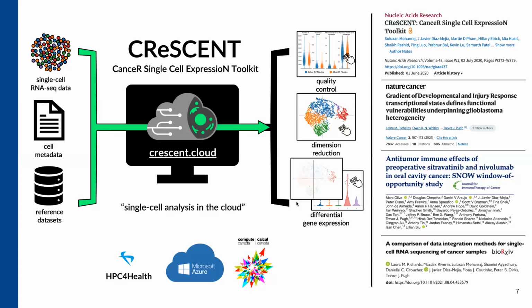And so what we did with Crescent was we analyzed the patient's blood and immune system and all kinds of different cells in order to see whether the immunotherapy actually changed the results. So in essence, we should be seeing a larger infiltration of immune cells based on this immunotherapy. And the main work from Crescent was the postdoc at our lab previously, Javier, and Hugh was the one that spearheaded that. So that was really cool as well.